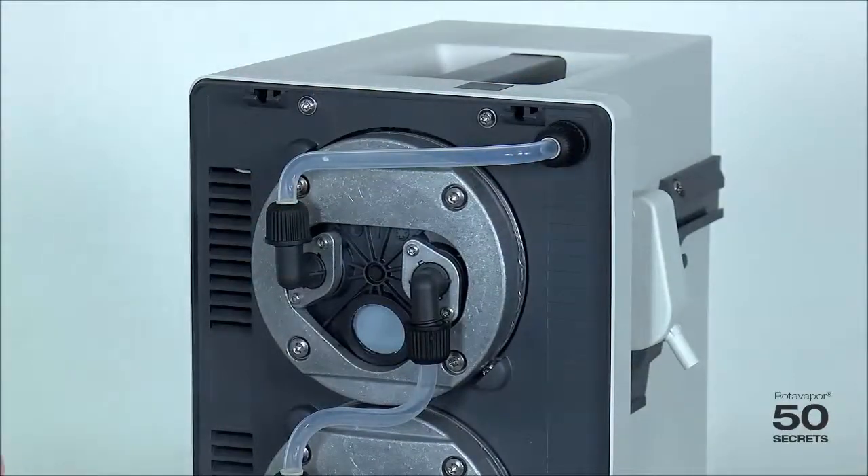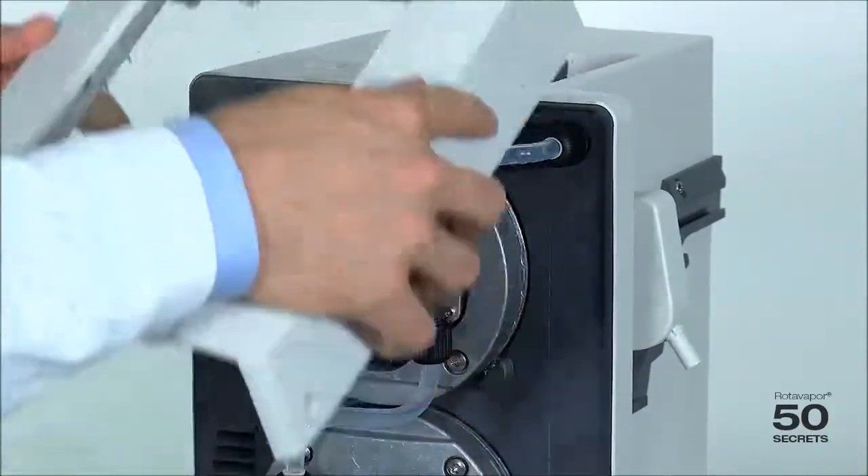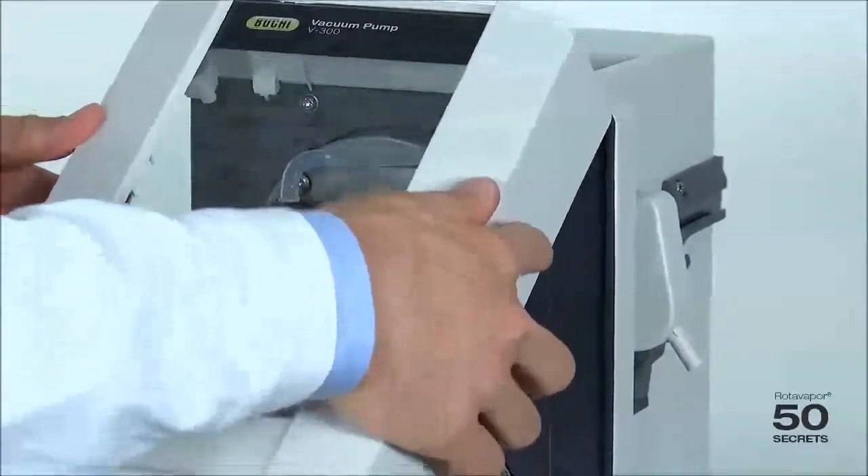Last but not least we use the cover and slide it in from the top like this.